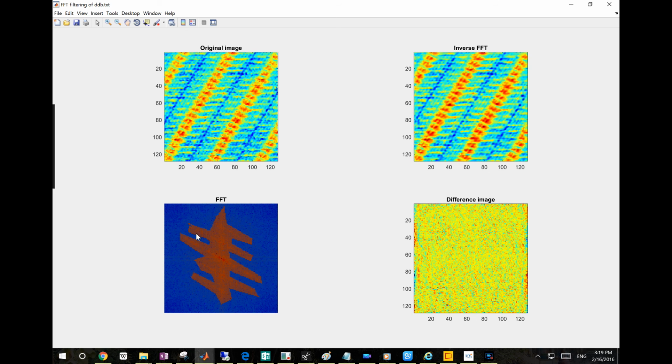So this is just a simple guide on how to use Fourier transform to keep the useful information and remove the unnecessary information. After you've done the Fourier transform, you can continue to do a cross correlation, which is also provided in image metrics, and then you can continue to average these specific structures by drawing a specific area to add them up and get a fine structure of your sample.